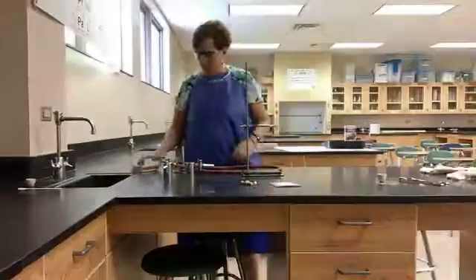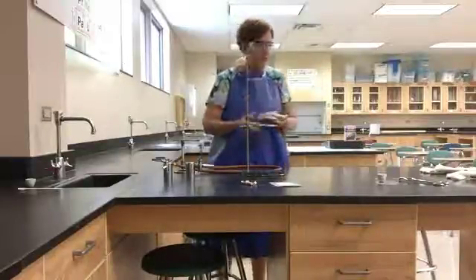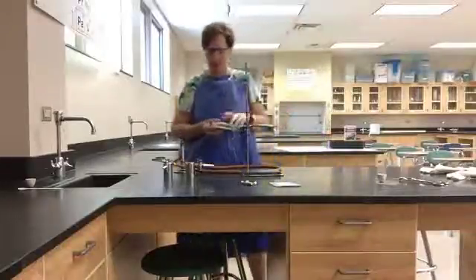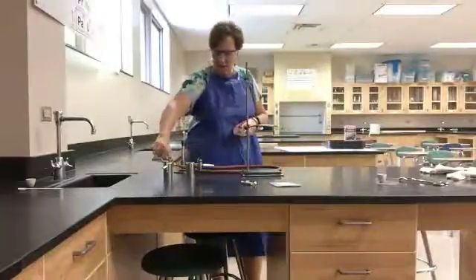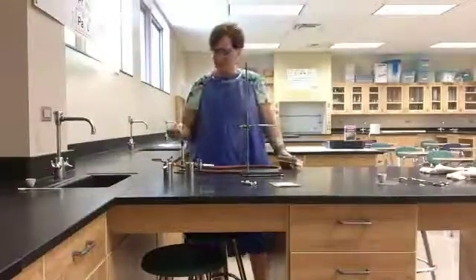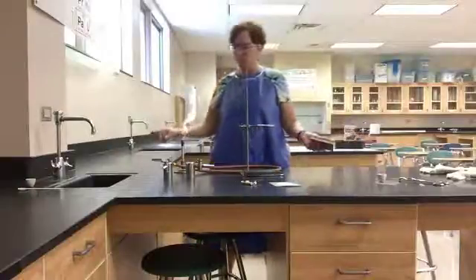Once you are ready to light the Bunsen burner, move away any paper towels or papers — anything flammable. Turn the gas on all the way, then to light the match, strike down firmly and confidently. And here you'll have a nice reasonable flame.